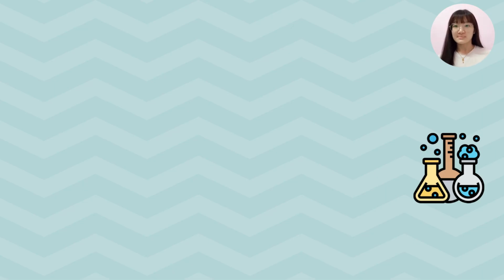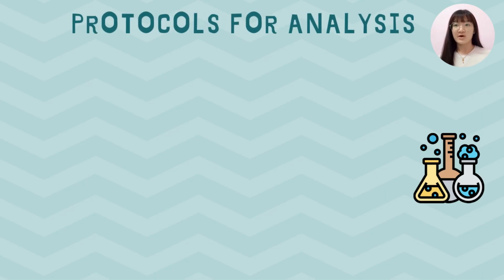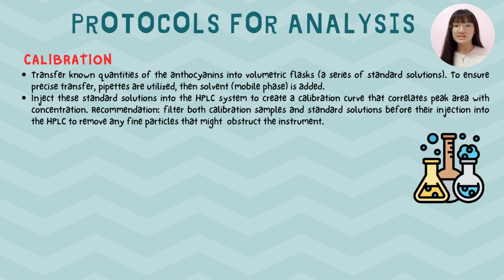I'm Gining, and now I'm going to explain the protocol for the analysis of our sample. There are three protocols to be followed for the analysis of our analyte, and the first step is calibration. Transfer known quantities of the anthocyanins present in red wine into volumetric flasks to create a series of standard solutions. To ensure precise transfer, pipettes are utilized, and then solvent is added.